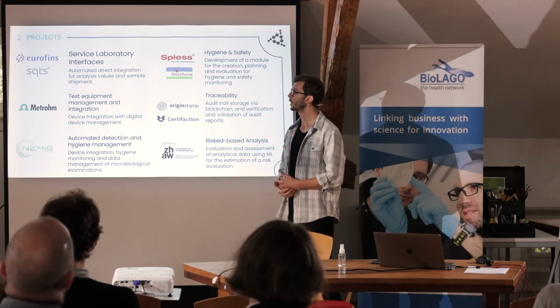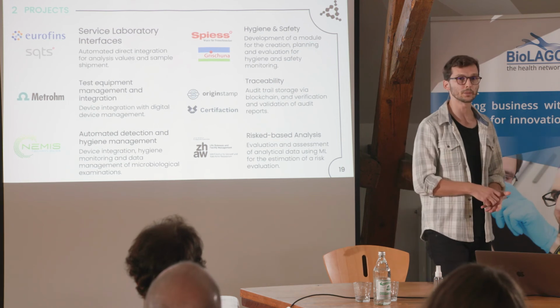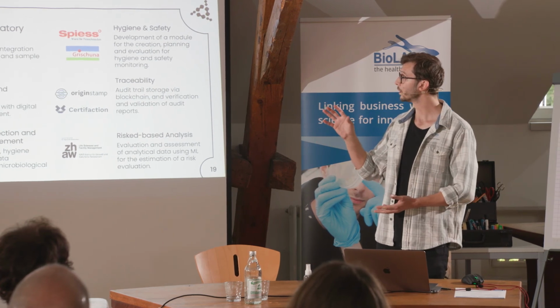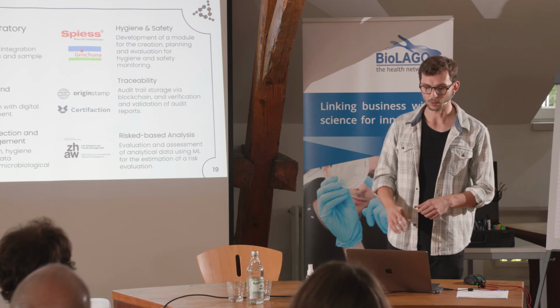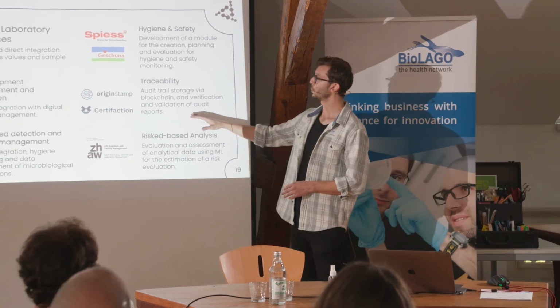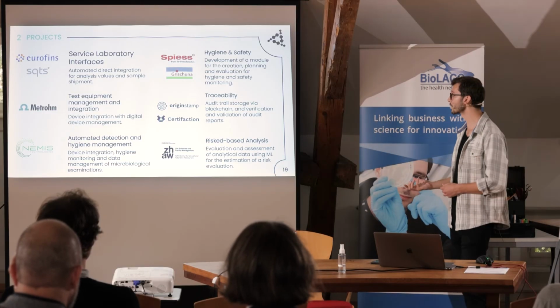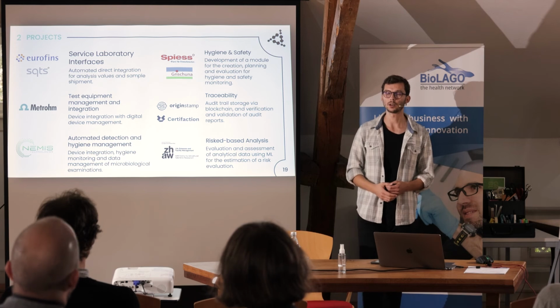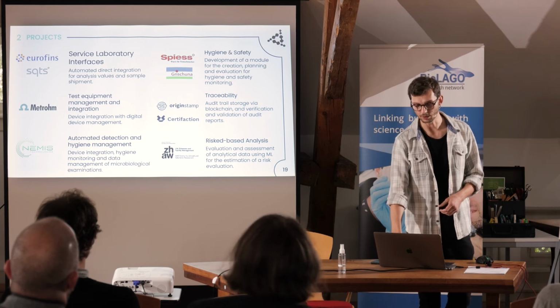One is a collaboration between Eurofins, OneLIMS, SQTS and ourselves to integrate our LIMS system directly into the service lab. So you don't need to use the service lab web portal. You can just add your samples and your order, combine them beforehand, send the order and get the results back more quickly than with the web portal. Another thing is what we are doing with validation of the reports and what happens to the audit trail. Most audit trails are saved in a normal database. We are thinking that in the future we could store the audit trail of the LIMS system in a blockchain, or even do the validation of the reports in a blockchain for thorough validation.